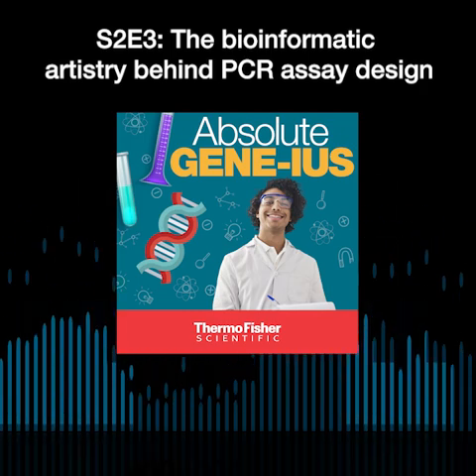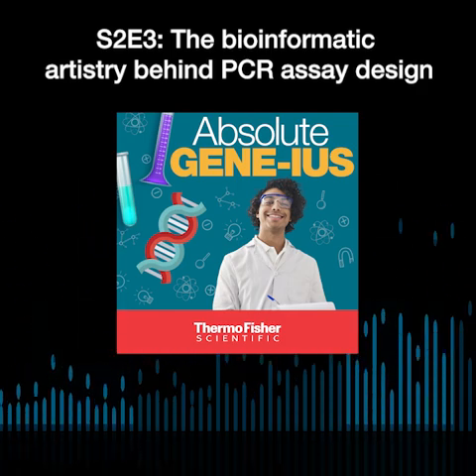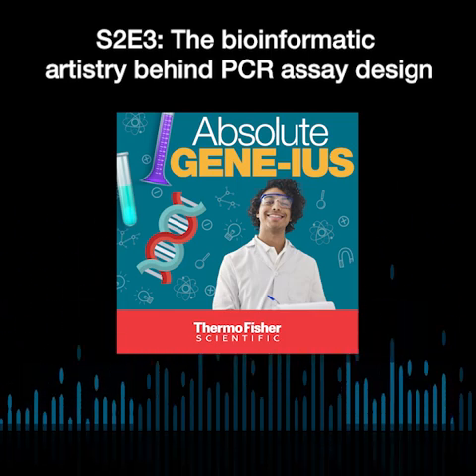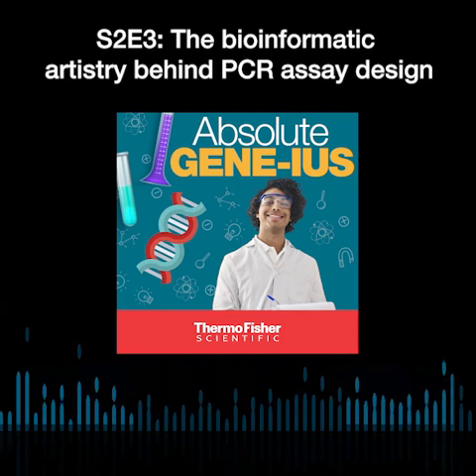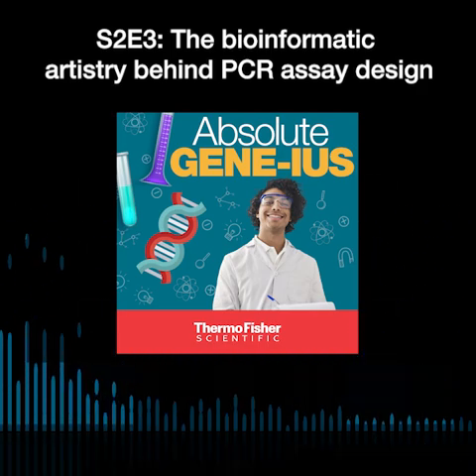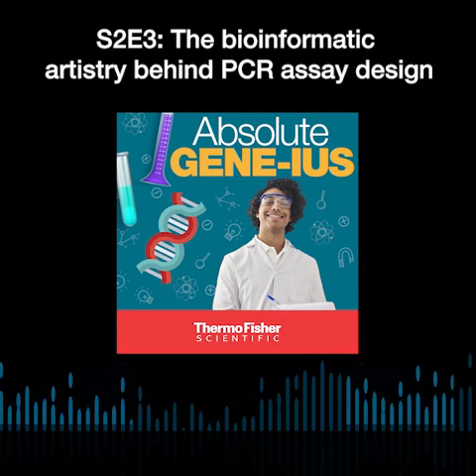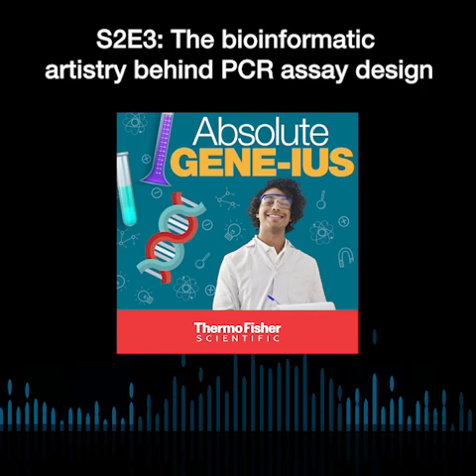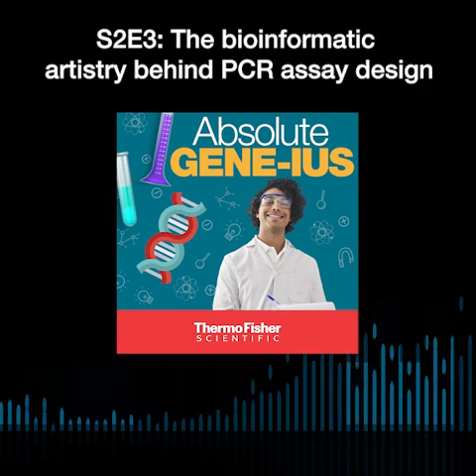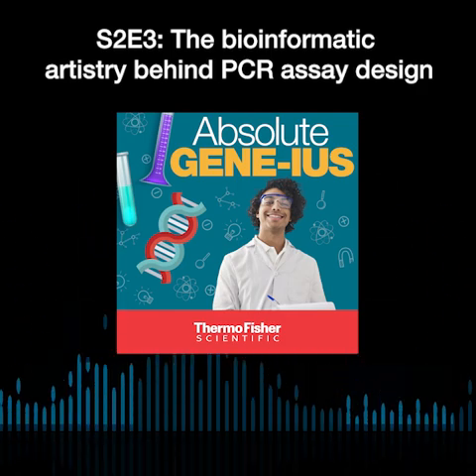So with that respect, I wanted to also add one more thing: generally it's a good idea to also think about what else will there be in your sample. So what's the background in your sample? Sometimes if your sample is going to be just from human, then your assay specificity just needs to be with regards to the human genome. If there'll be a sample which will have a mixed community, like if it's a microbial sample, if it's going to be something for surveillance, then you have to design the assay with what you can find in the background in the sample as well.